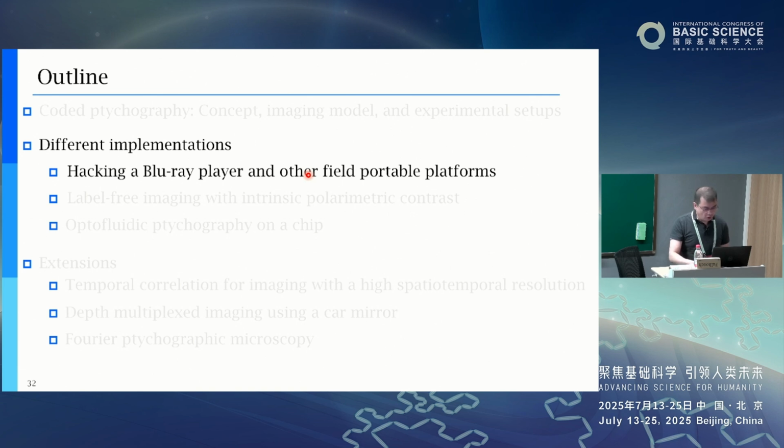With that, I want to talk about different implementations. One fun project here is we tried to hack a Blu-ray drive.